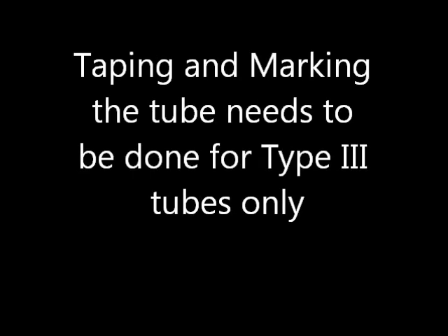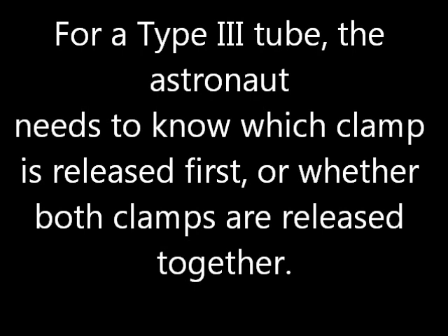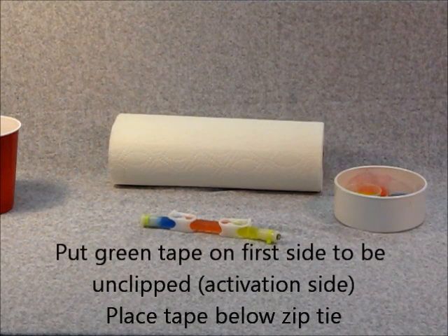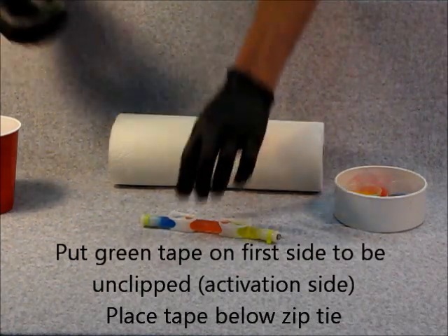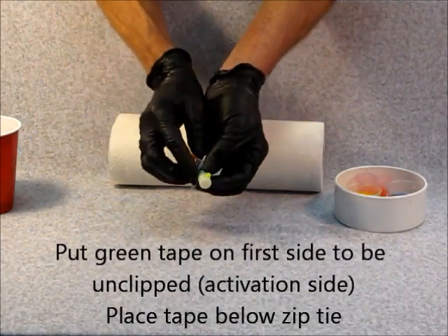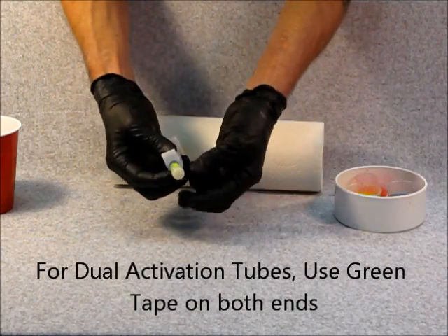Taping and marking of the tube needs to be done for type 3 tubes only. For type 3 mixture tubes, the astronaut needs to know which clamp is released first, or whether both clamps are released together. Color coding has been agreed upon by NASA and NanoRacks as the means to do this. Place green tape on the first side to be unclipped — this is known as the activation side. Always put the tape on both ends.